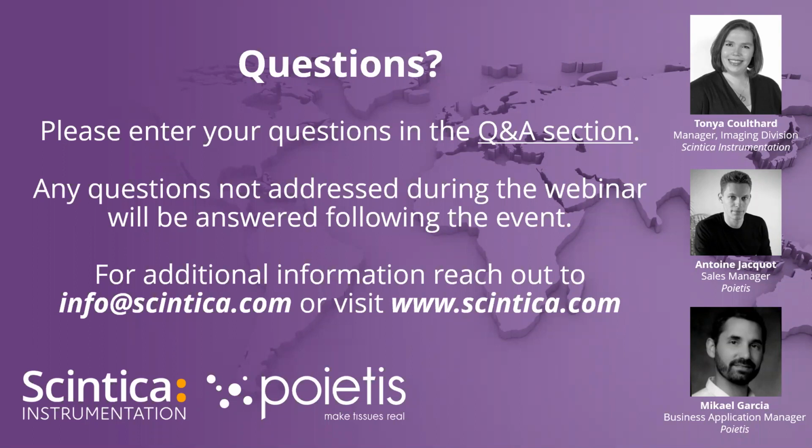Perfect. A question going back to the basics of the system, and perhaps I'll take a stab at answering this one first, and then you can add in afterwards. It was just a question of, can we explain again what we mean by 4D printing? When we think about printing, we obviously think about printing in 3 dimensions. So we use that integrated computer to take our cell patterns that we outline on the CAD software. We may integrate layers of collagen or different extracellular matrix compounds, different materials to make a 3D structure. That 4th dimension comes in terms of time.